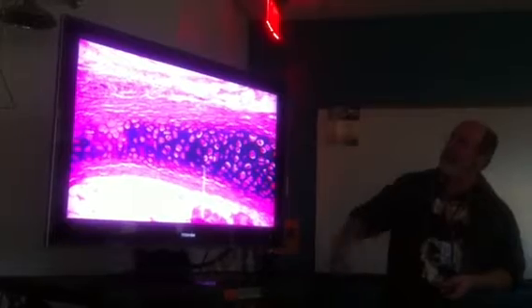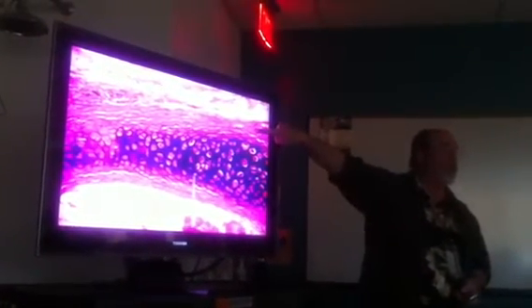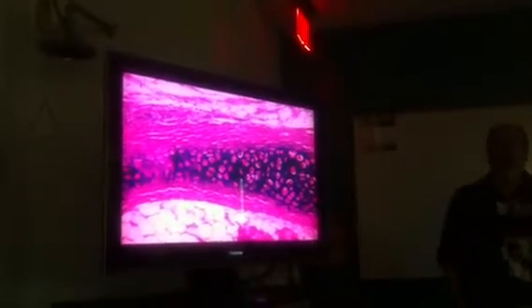So I could point to this perichondrium: what kind of tissue is this? What does it look like? There you go. It's dense irregular connective tissue. So we have dense irregular connective tissue as perichondrium. We have elastin in the matrix. We have elastic cartilage and a little adipose tissue down there. And there's just a few little factoids that you have to remember.